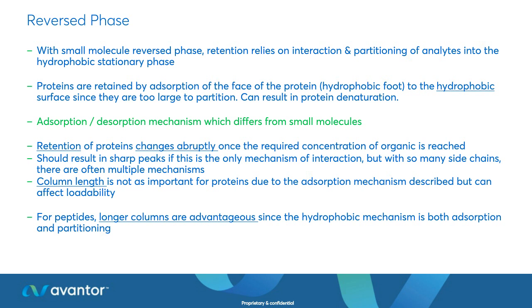But when you've got a very complex molecule like a protein, we don't have the very simple hydrophobic interaction. You have the potential for a lot more ionic interaction, hydrogen bonding, other mechanisms in there that actually interfere and don't give us that nice sharp peak shape. Hopefully if I scroll on to the next slide, you will understand this a bit further.